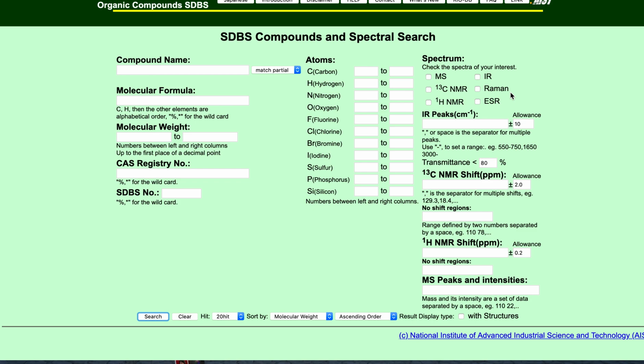And you want to have just a brief introduction. Okay, now when you enter here, you can put the compound name, methane. But if it's a 1.5 mile long name like IUPAC, you remember what was it, chapter 3 in lecture? You have to have that name exact or it won't find it. You can also put the molecular formula down or the molecular weight range. You might say, for example, I want to know everything from 100 grams per mole to 200 grams per mole. Also, you can have the Chemical Abstract Service CAS registry number.